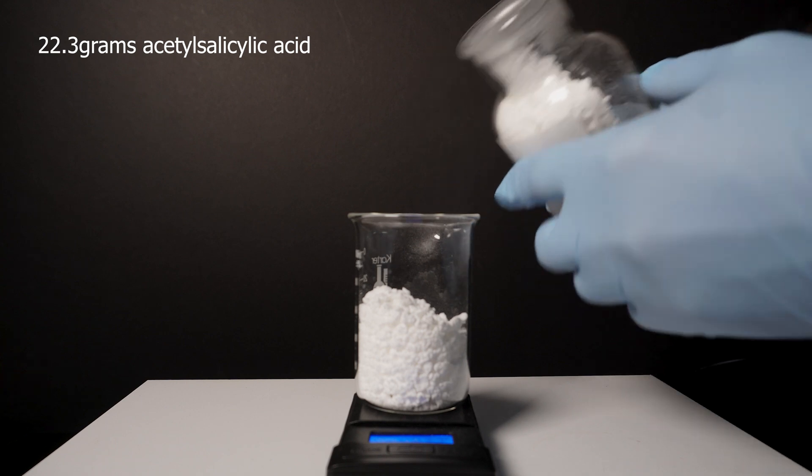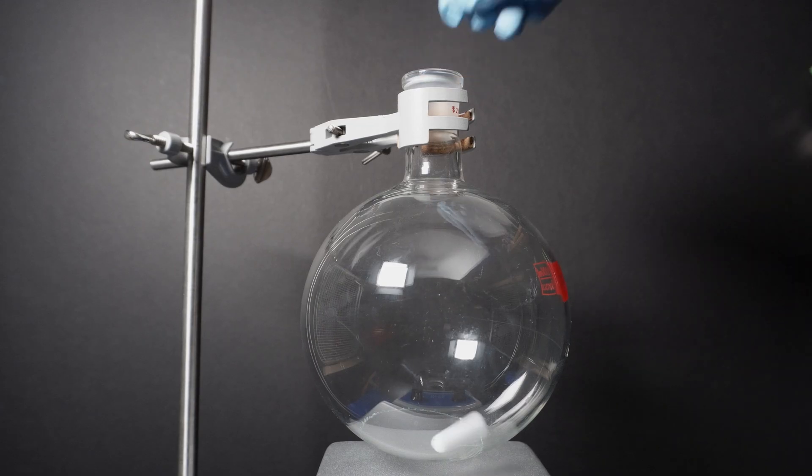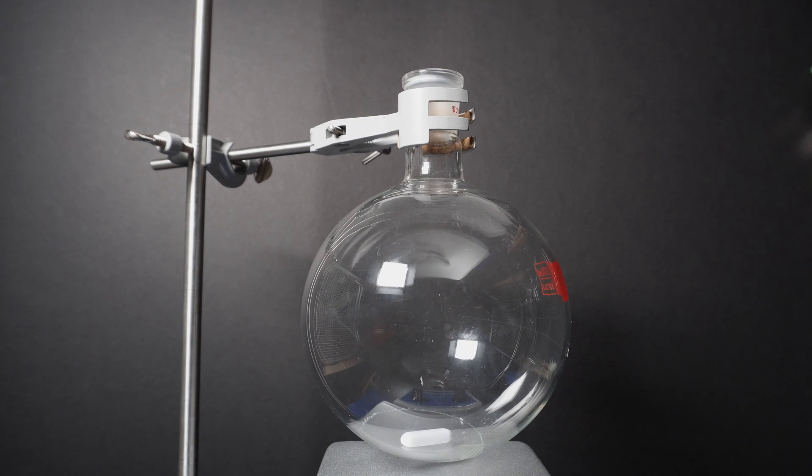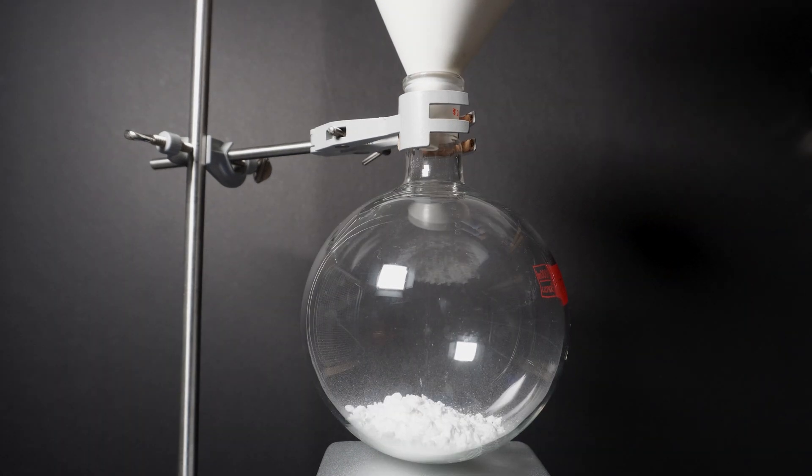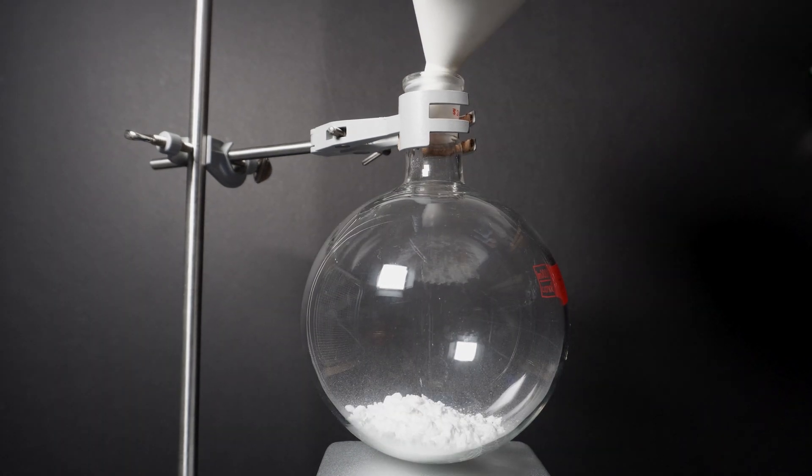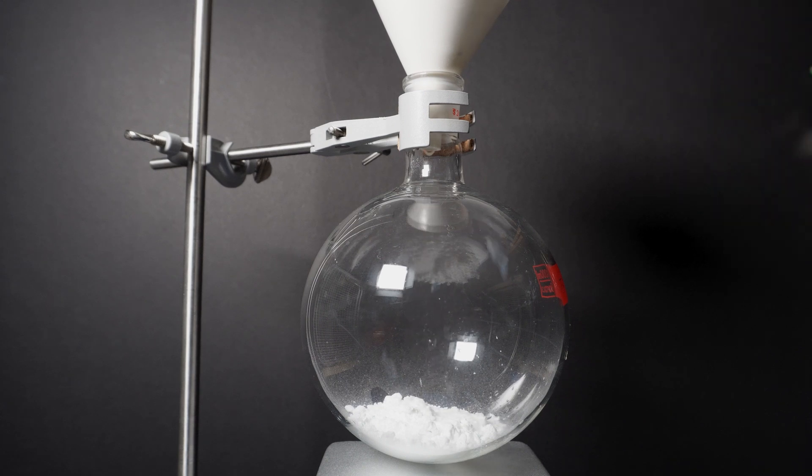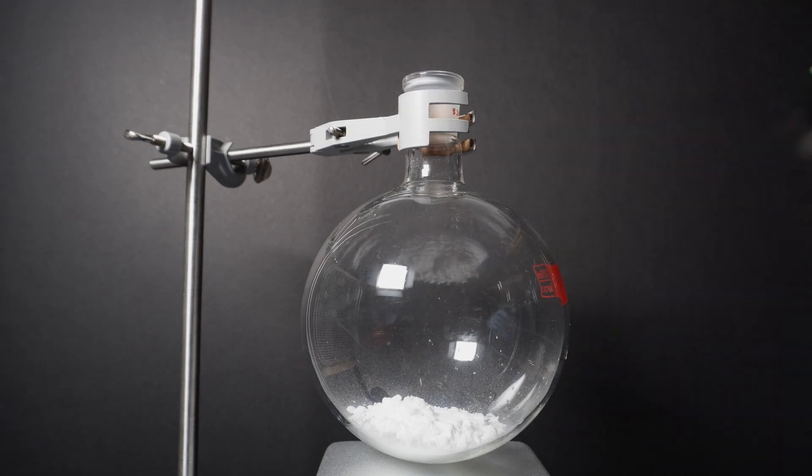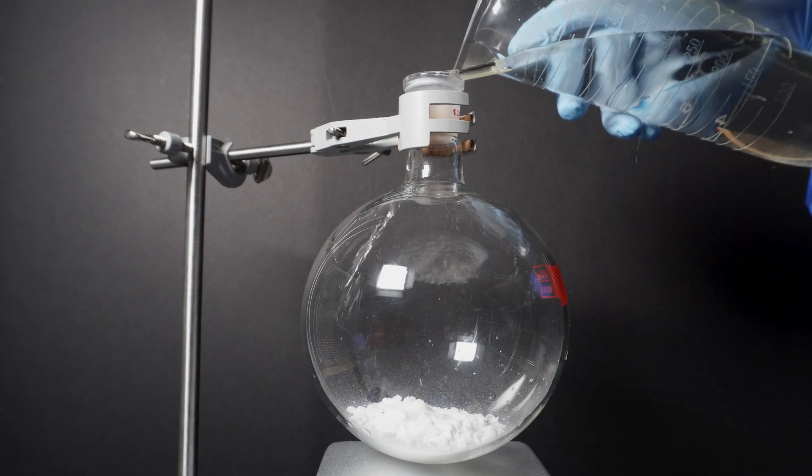We will start by weighing 22.3 grams of our ASA into a small beaker. We next prepare a round bottom flask by adding a stir bar followed by adding the 22.3 grams of the ASA. I also wash the beaker and funnel with a little bit of distilled water.